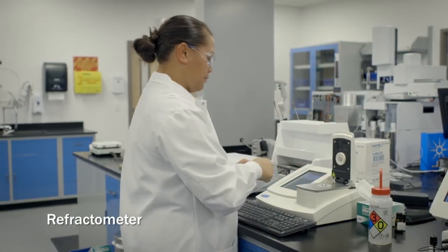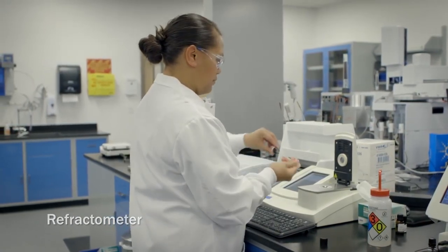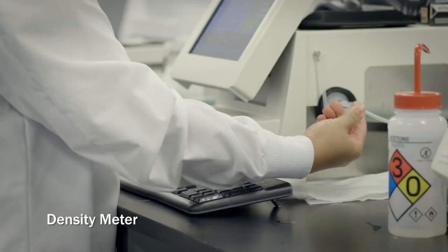A refractive index, which is done by a refractometer, because each essential oil twists light in a different way. And then the specific gravity, which basically measures the difference of weight between water and the oil.